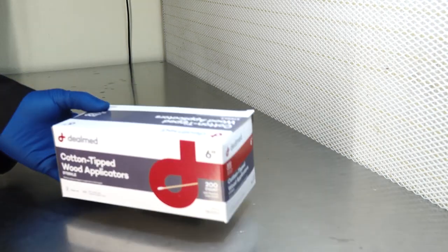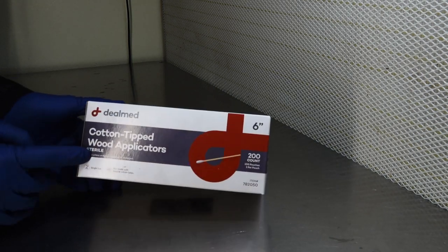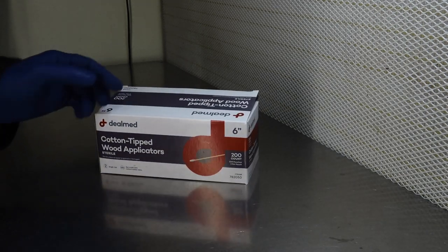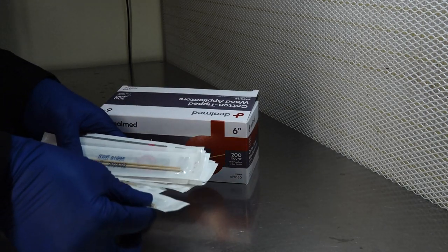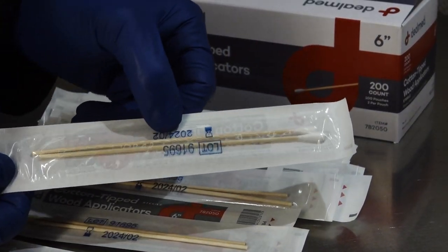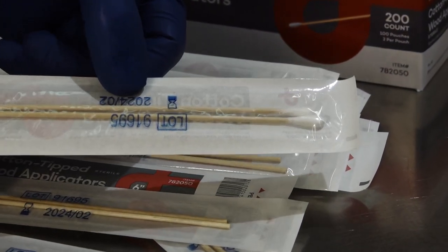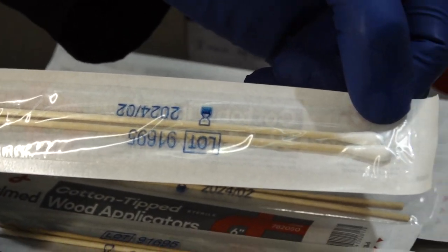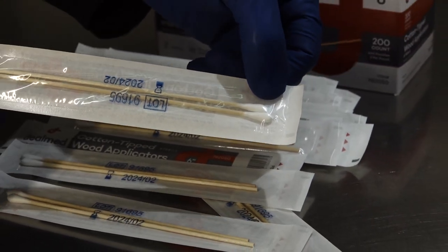Alright y'all, so if you guys would like to do this at home, I'm going to be listing all of the materials that we use so you can follow along with us. First up, we have our sterile cotton-tipped wood applicators — that's pretty much just a fancy way to say big-ass Q-tips. These are the types of Q-tips that would be found in the doctor's office or health care provider's office, used to take saliva samples or booger samples, stuff like that.